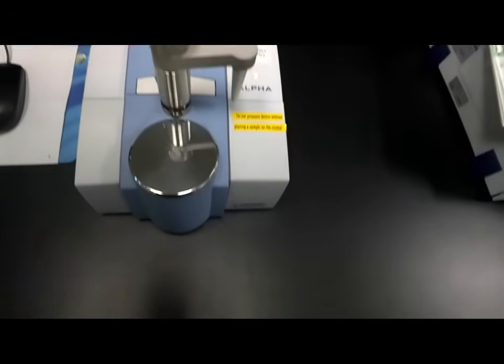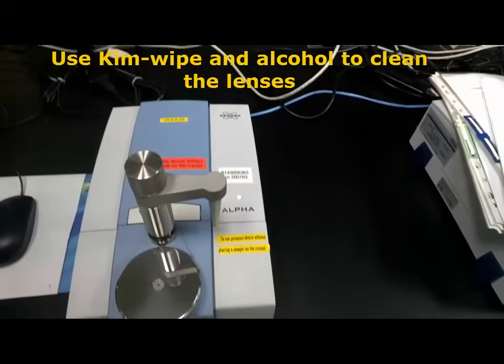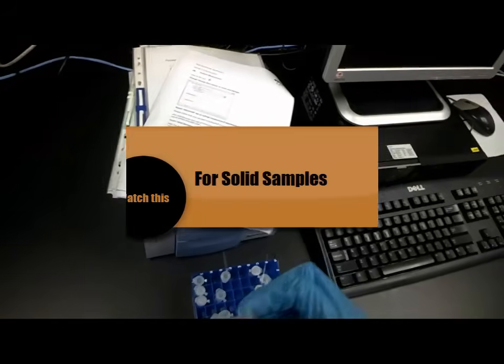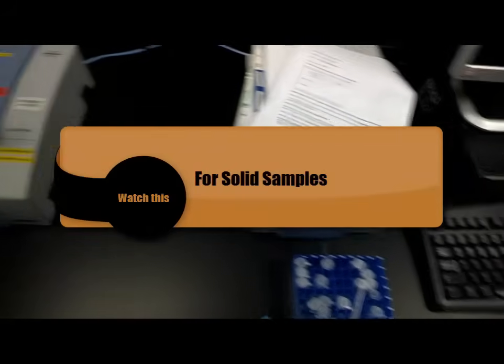But in future, before you do any background scan, you should use a piece of tissue paper with alcohol and wipe the surface. For the solid sample.